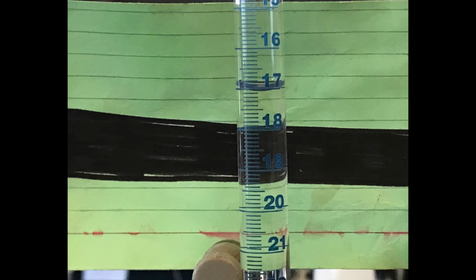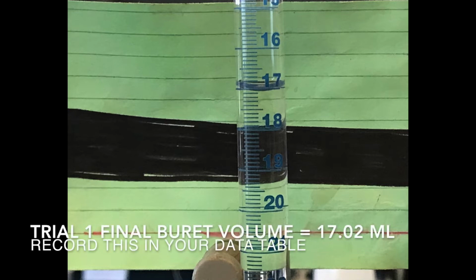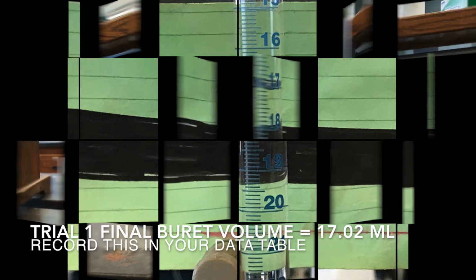So my estimate for the final burette volume is 17.02 milliliters. So go ahead and record that volume, 17.02 milliliters, as the final burette volume in your data table.